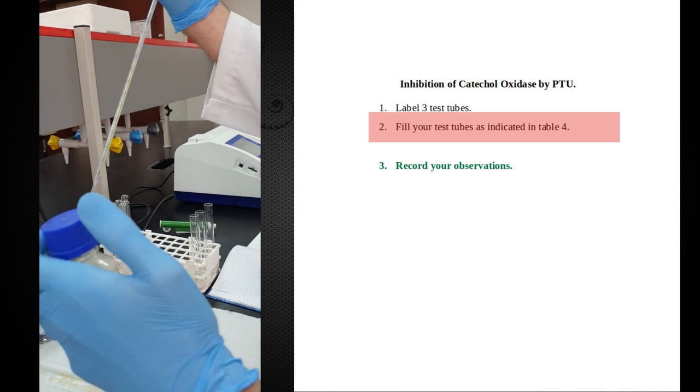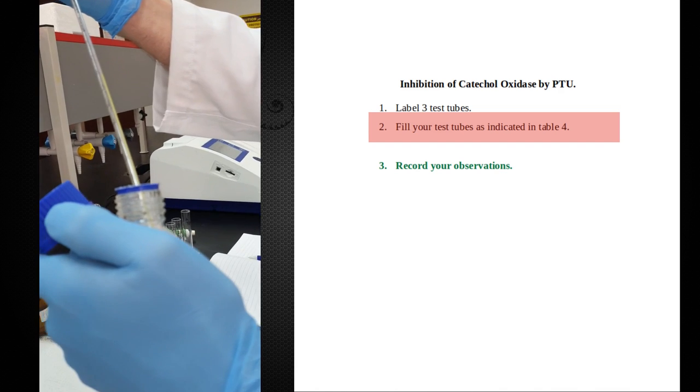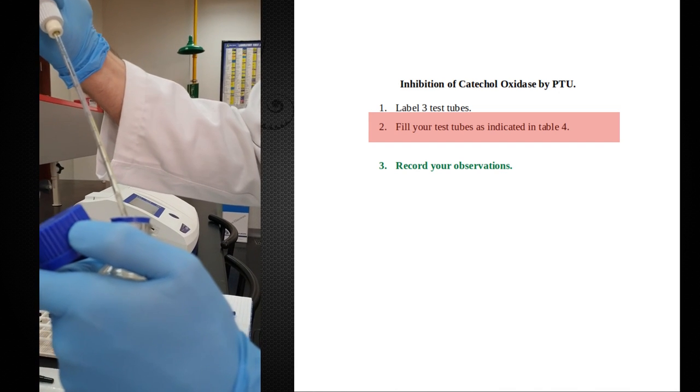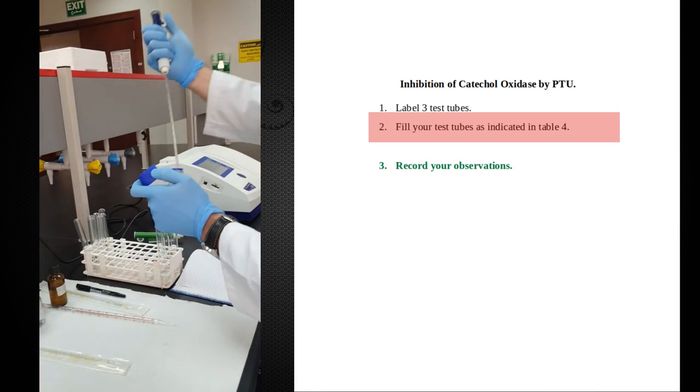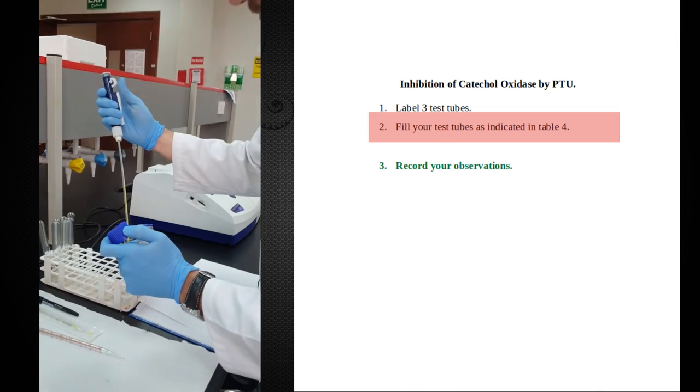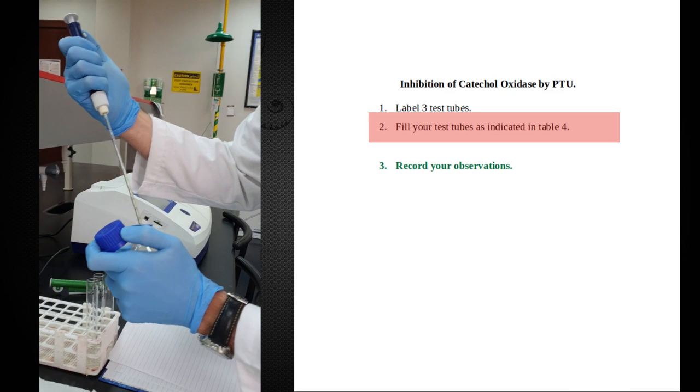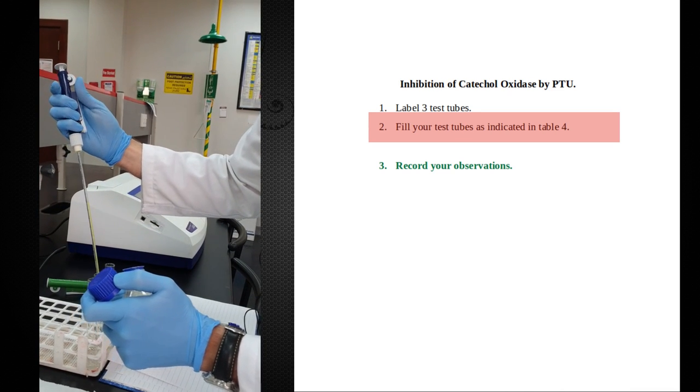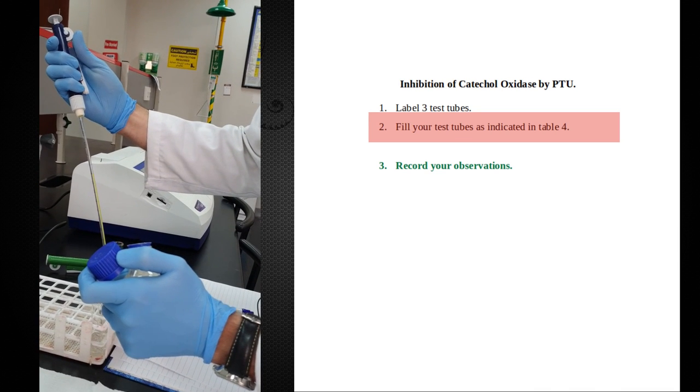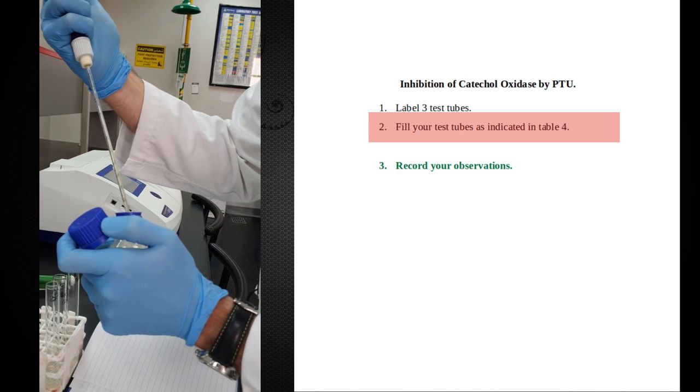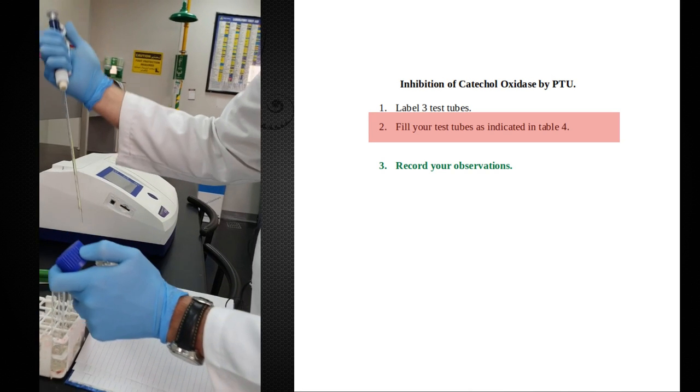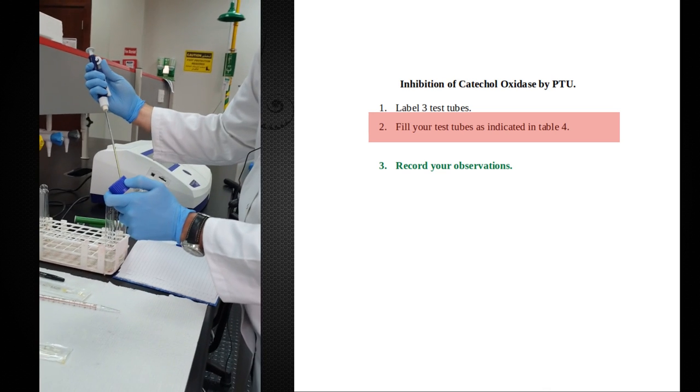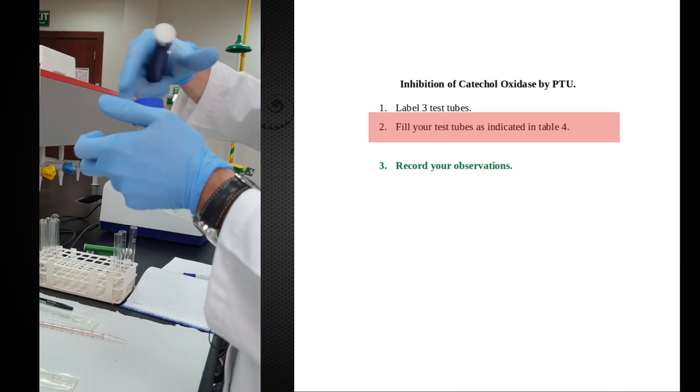I'm going to try not to take up too much of the solid material inside this potato juice. I'm just going to try to get the enzyme without the extra starch. That's my 0.5 milliliters. So I'm going to add to tube one, tube two, and tube three. They all get the same amount of enzyme.